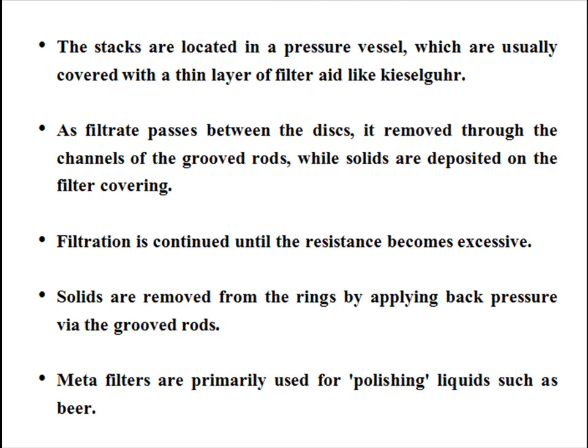The rings are aggregated on the rods. The stacks are located in a pressure vessel and are usually covered with a thin layer of filter aid like diatomaceous earth. As filtrate passes between the discs, it is removed through the channels of the grooved rods while solids are deposited on the filter covering. Filtration is continued until the resistance becomes excessive. Solids are removed from the rings by applying back pressure via the grooved rods. Metafilters are primarily used for polishing liquids such as beer.